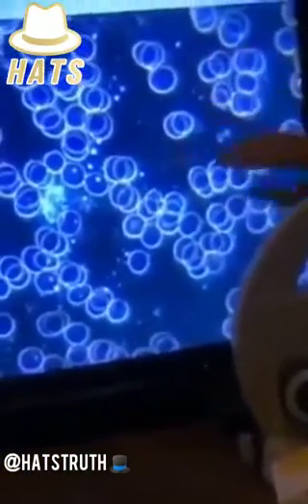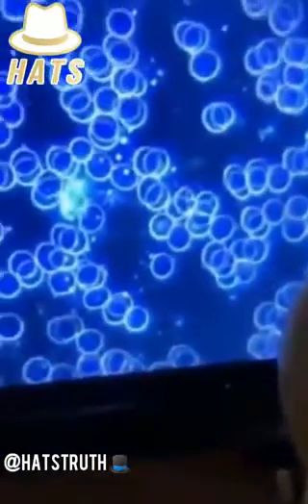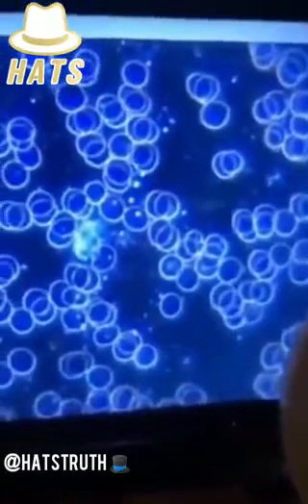What is also important is that the serum space is clean like here, so there shouldn't be any things like what you will see soon in the vaccinated people. We found very strange stuff in his blood, which I haven't seen in 30 years doing microscopy. So when did your patient come in?